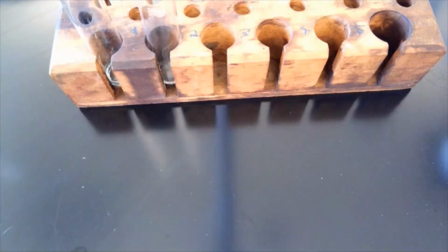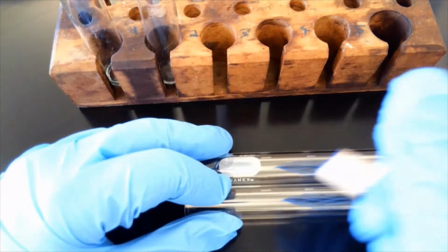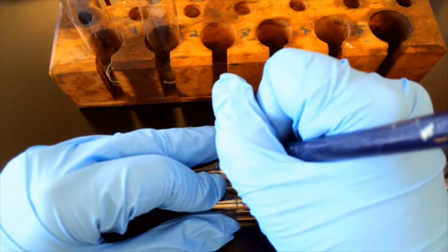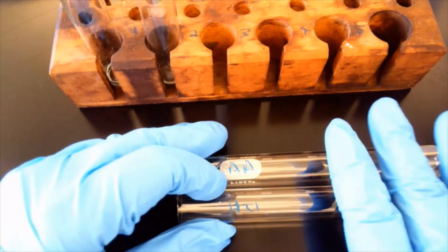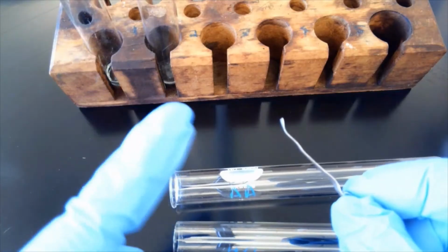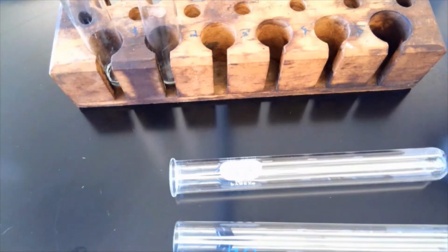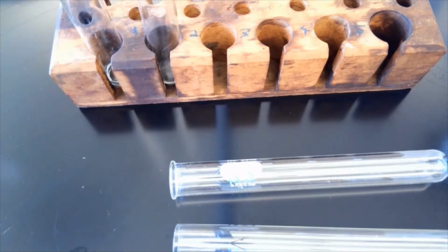So the next two that we're going to do, we're going to use some magnesium. So again, we're going to take our 2 test tubes and we're going to label them. So we'll label one HCl and the other for our acetic acid. I'm just going to call it AA. And in this case, I'm going to let these rest here, we are going to use a strip of magnesium. And I've already polished this, meaning I've taken some sandpaper and taken off the edge. So we're going to cut some small pieces off.